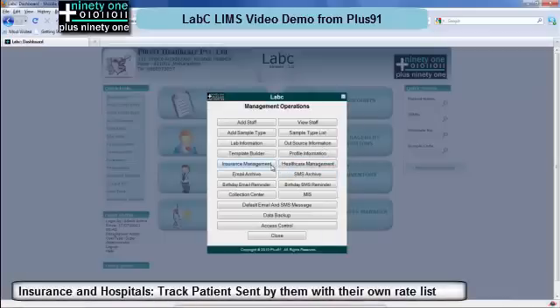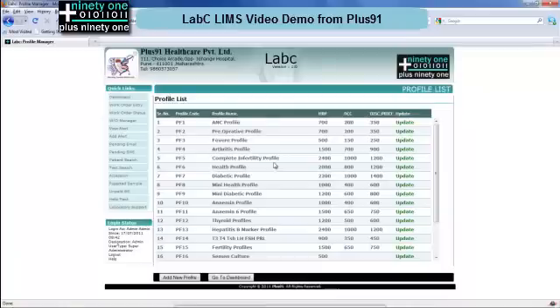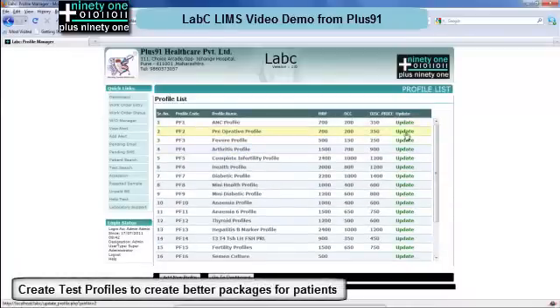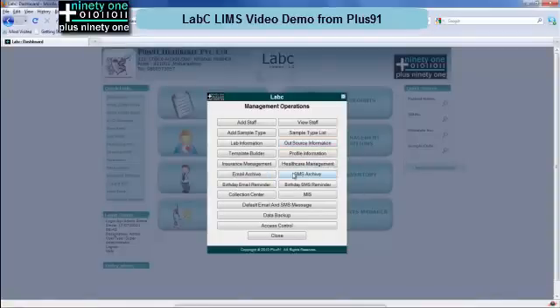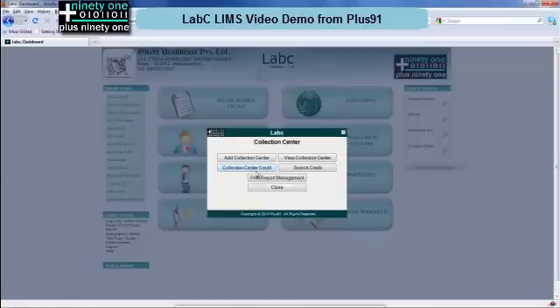Next you have insurance and healthcare management. Here you can define hospital insurance companies which send patients to you and track their total billing for the month. Profile management allows you to create profile lists and select groups of tests with a single rate list — this allows you to give better packages to patients without the headache of tracking them on paper. You have an SMS and email archive for times when SMS and emails have not gone due to internet connectivity being down, and you can auto-send them from here directly. You can also send birthday SMS and email details.